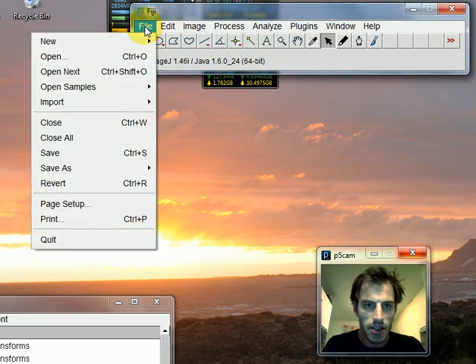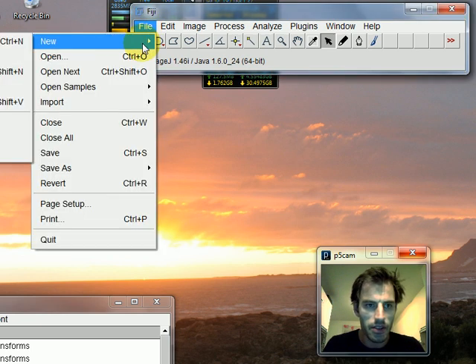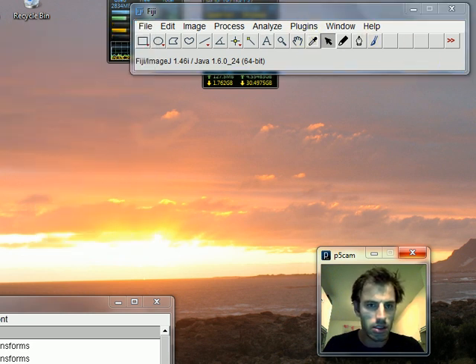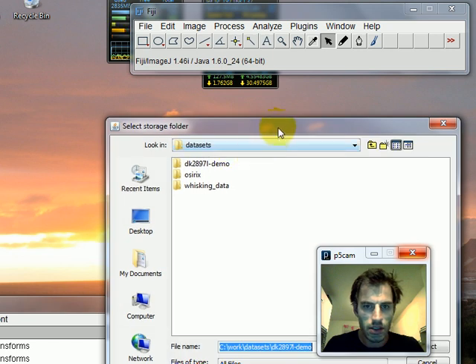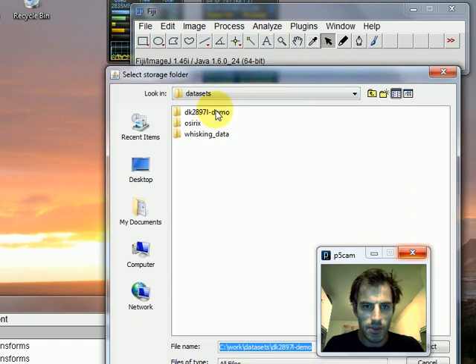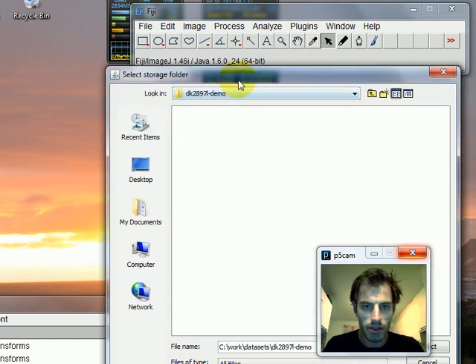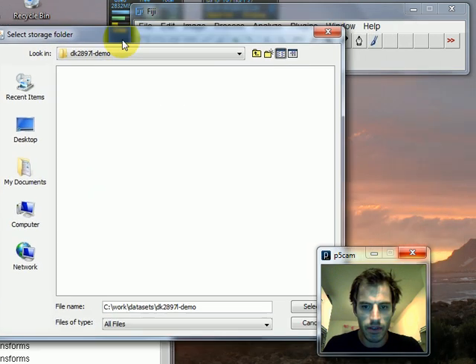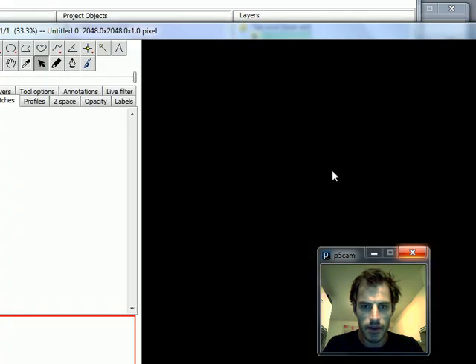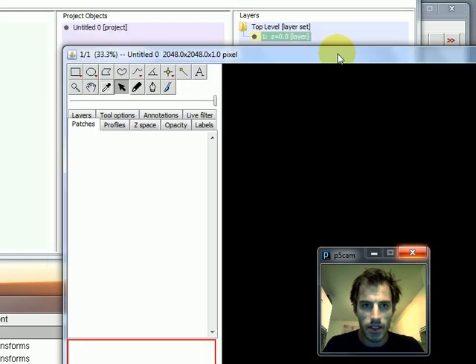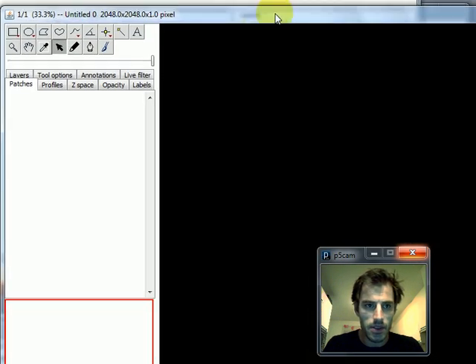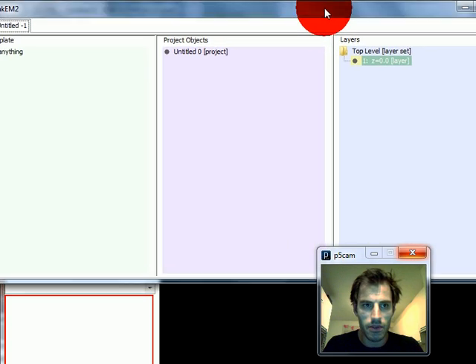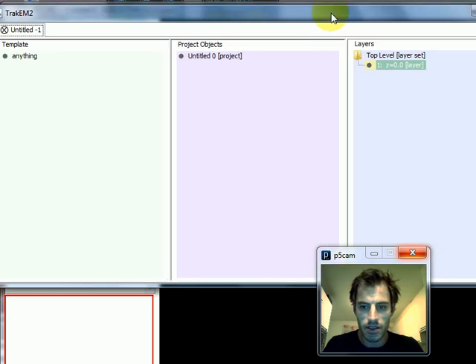So first I do a new TrackEM2 blank. It asks me for a storage folder, I pick my data folder, and it opens the TrackEM2 interface.